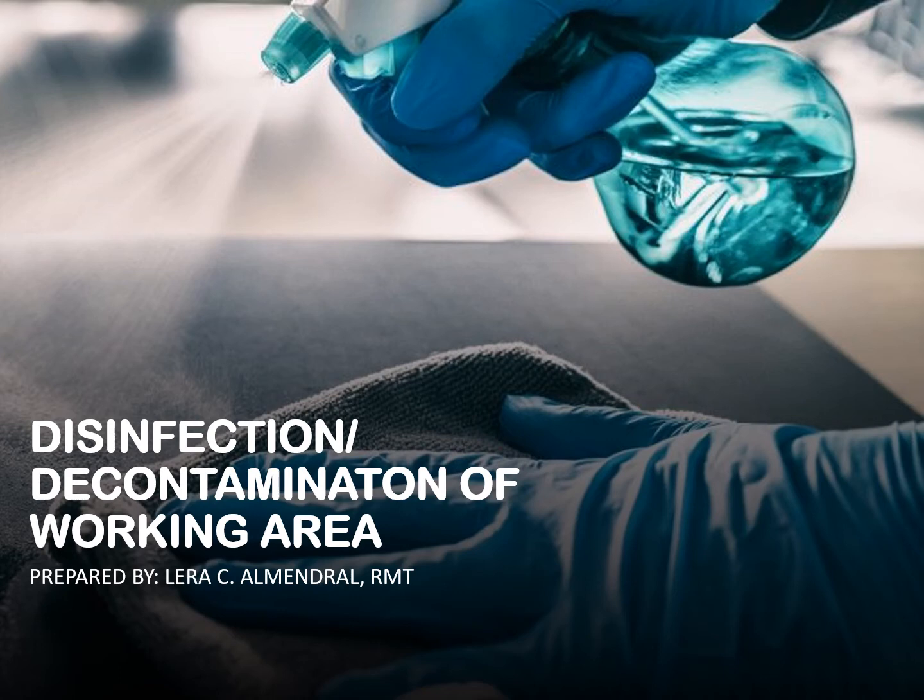Good day, everyone. Today we are going to discuss disinfection or decontamination of the working area. This lesson is an essential aspect in making our surroundings clean and free from contaminants. Surface contaminants are very common in any working area inside the laboratory. Dirt is easy to detect, but biohazards are not.